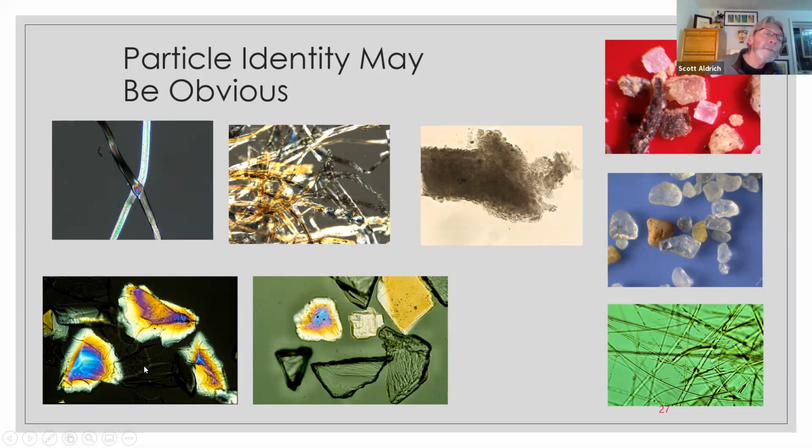And in the bottom left is a cross-polarized shot of glass plus quartz plus glass. So quartz is the one that looks like a little Hawaiian island here. And remember I talked about that fringe, you could tell the thickness. So in the very center, it's the thickest, and it goes to a very thin edge. Same thing here, same thing here. These three are all quartz.